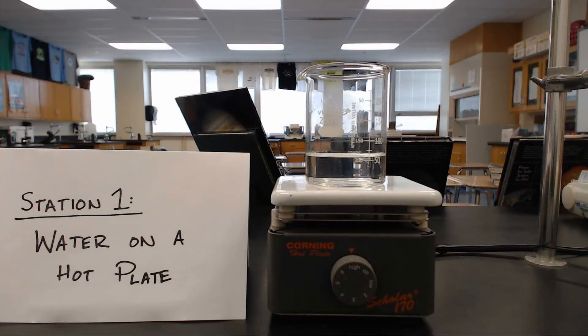Hey everybody, this is a station's activities on chemical and physical changes, and we're going to start right here with station number one, where we put water on a hot plate and it heats up. It's sped up until the water actually starts doing something. Take a look and make your observations and jump right into it.